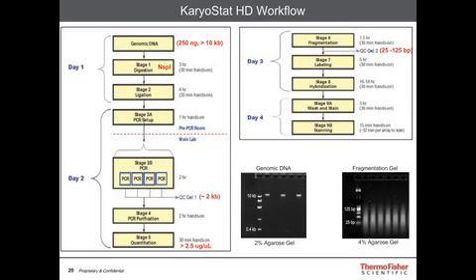Therefore, a mandatory QC gel is necessary, and ideal fragment size should be between 25 and 125 base pair. The fragmented DNA is labeled with biotin and next hybridized to the probes on the array. Non-specific DNA is washed off and then stained before scanning the array.